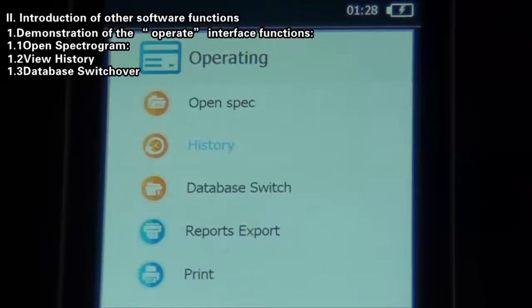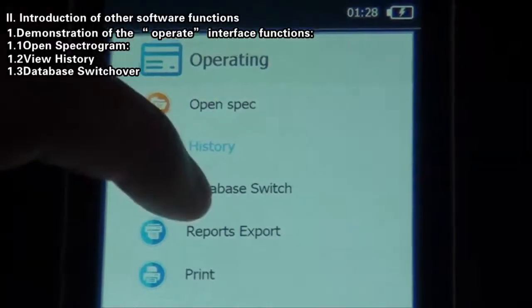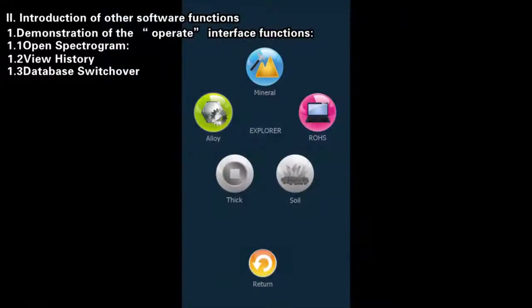Database Switch Over: Click Database Switch Over to carry out the selection of Industrial Database Spectrogram. After the selection, the software will automatically reboot and enter into the main interface.